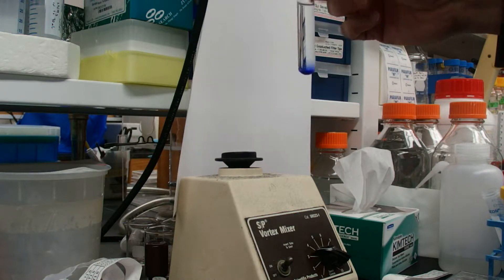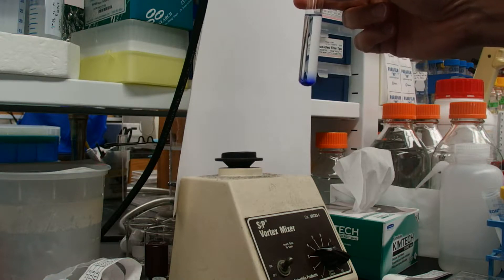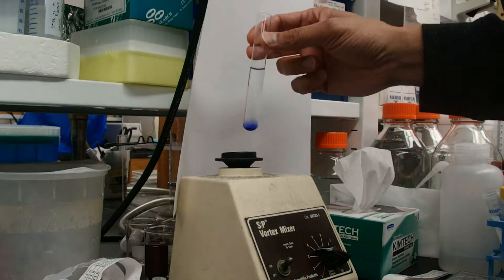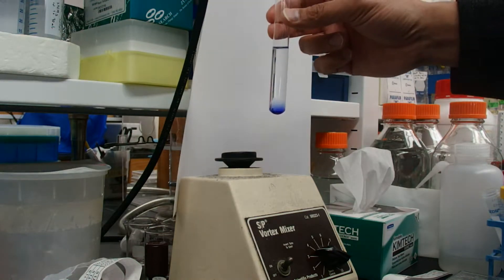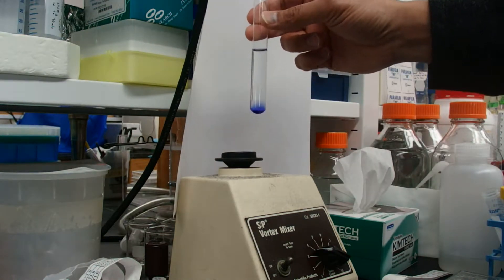So that's why we have devices like a vortexer, or we can mix by pipetting. A vortexer, when done properly, will generate a swirl around the outside of your tube.